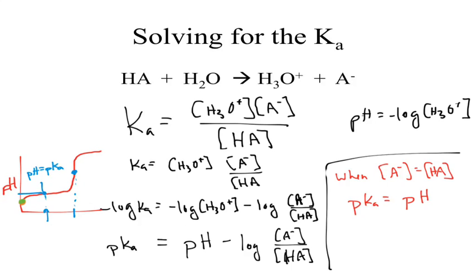We will talk about it again on Thursday. All right? So we can determine the pKa by evaluating what's happening on our pH curve or our titration curve. That's why we go through and play with that curve. Okay? It allows for us to determine that value. So it's kind of nice. Okay? Questions about that right now?